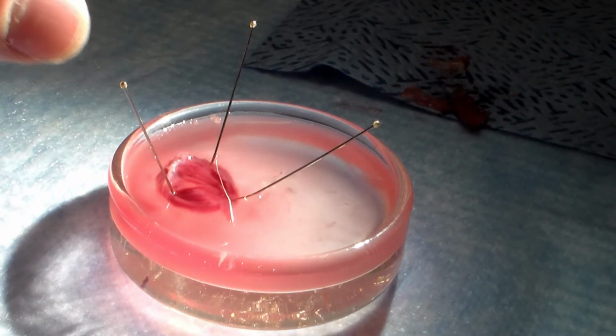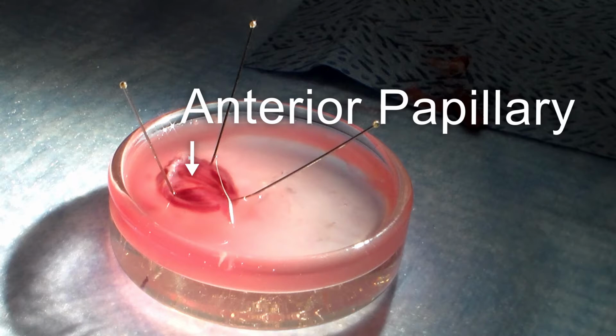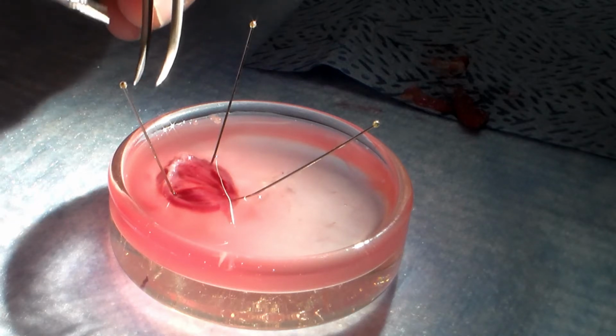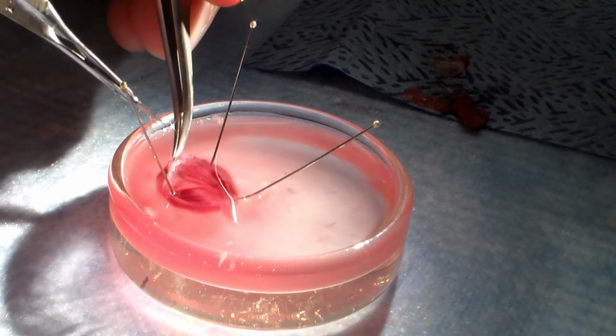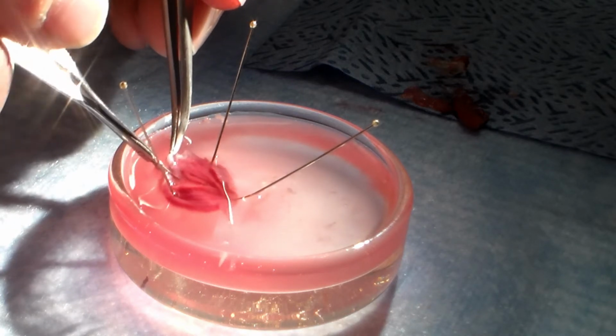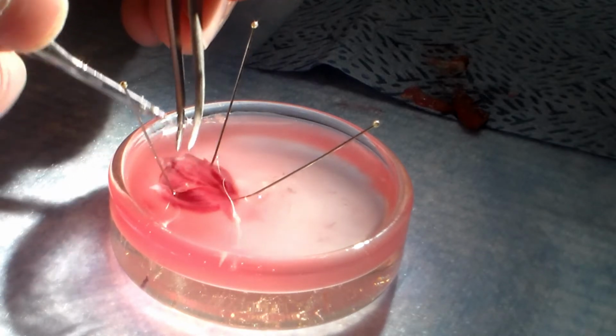Relative to the technician, the heart is now upside down and the apex away from the technician. The anterior and posterior papillary muscles are now visible. The anterior papillary muscle is to the left of the technician, and the posterior papillary muscle is to the right.